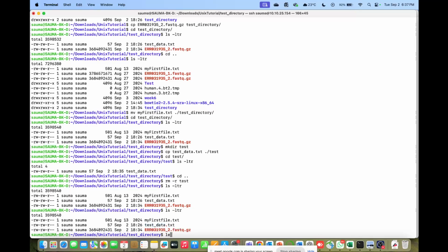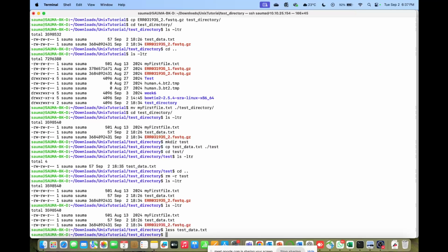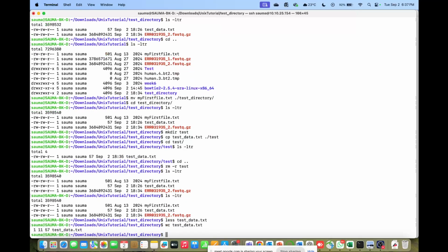First, let's see how many words there are. So 1, 2, 3, 4, 5, 6, 7, 8, 9, 10, 11 words are here, right? Now, if you do wc, see, it's given me 11.